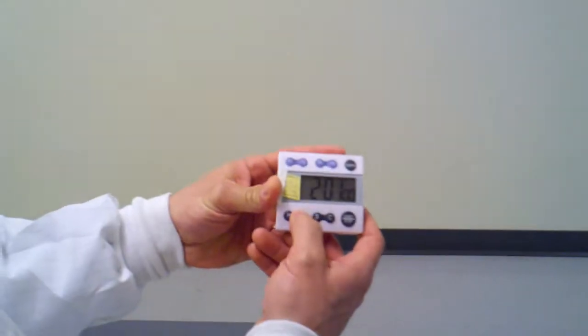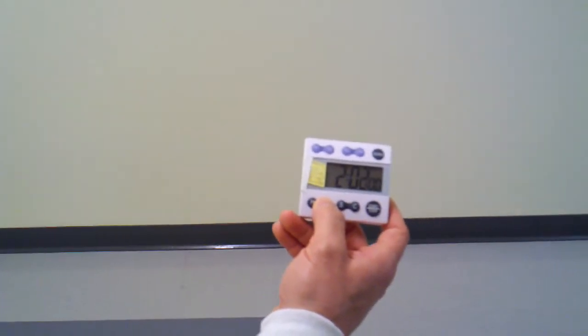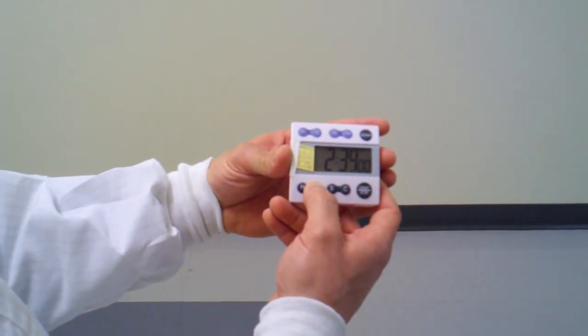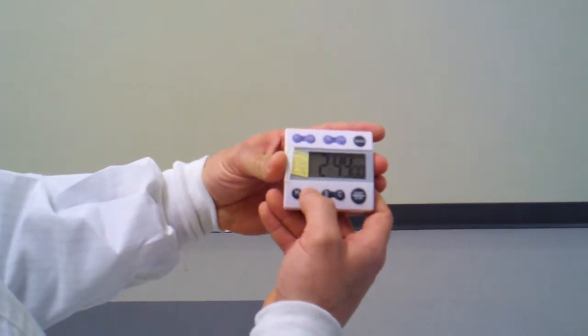And we're going to set our timer for 2.75 hours. So let's do that right out here. So we're going to go hour, hour, hold down the minute until it gets to 45. And when that rings, we're going to come back and induce ourselves for the rest of the electroporation.